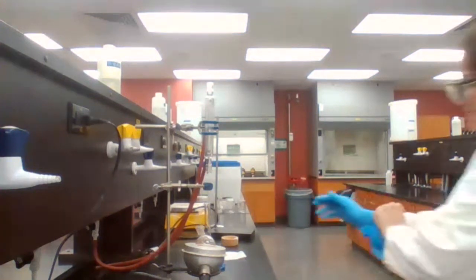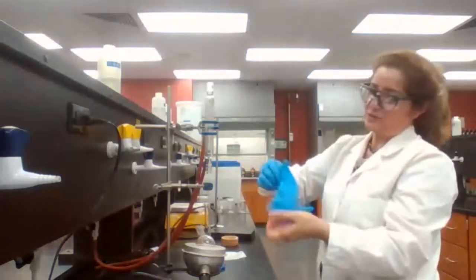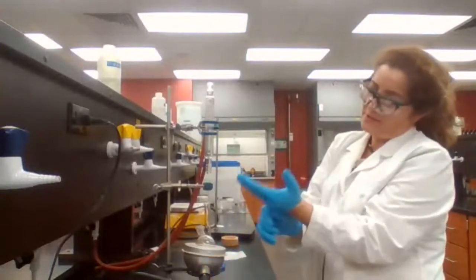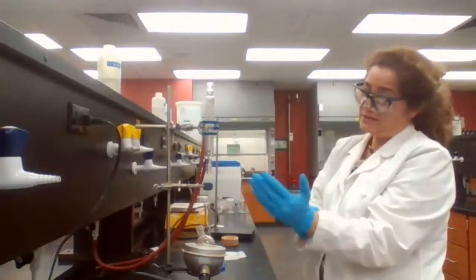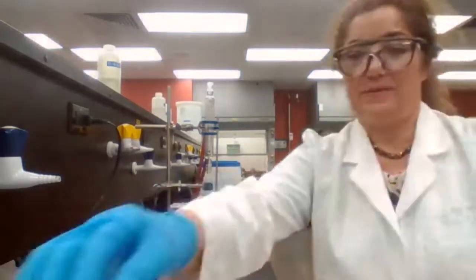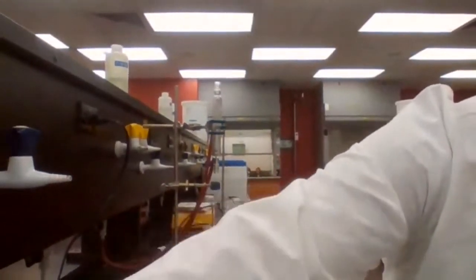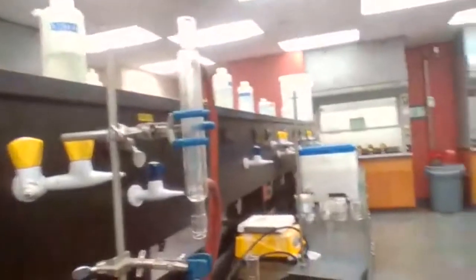The better practice and the right lab technique is to use gloves all the time, lab coat and goggles. Sometimes when the chemicals are not that dangerous, that I know they are safe to handle, I refuse to use gloves, but I can't do that with sulfuric acid. So I'm going to take you close to the fume hood.